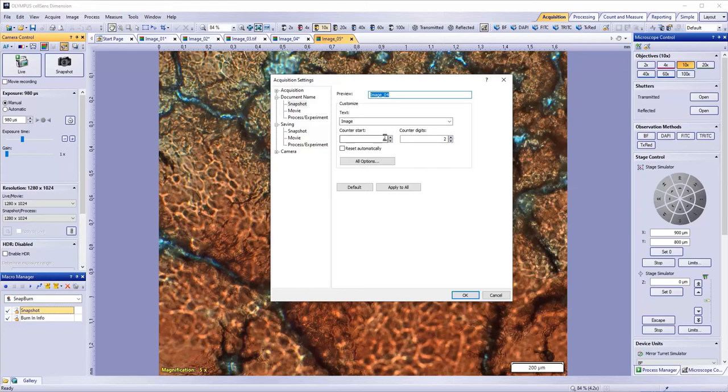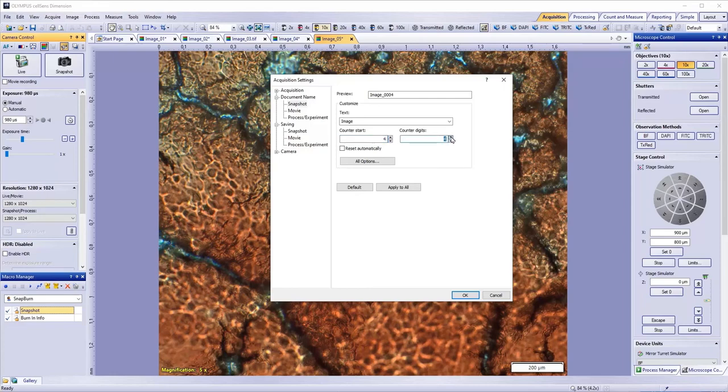You can also tell the program to start at a specific number by entering it in the Counter Start. Change the counter digits to tell the program how many digits of the counter to display. Using the Reset will reset the counter to 1 once you restart the program.